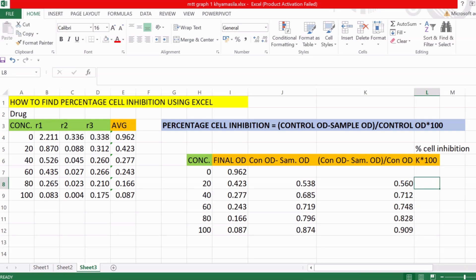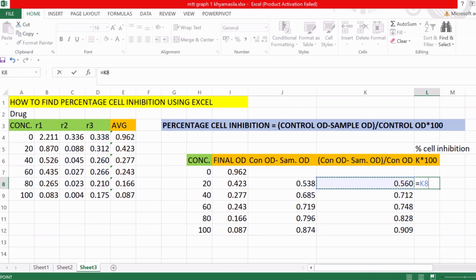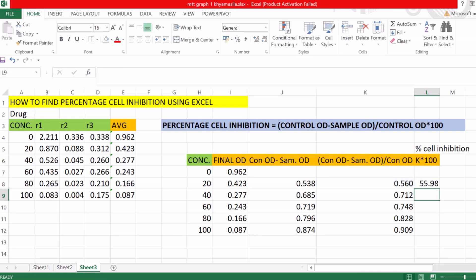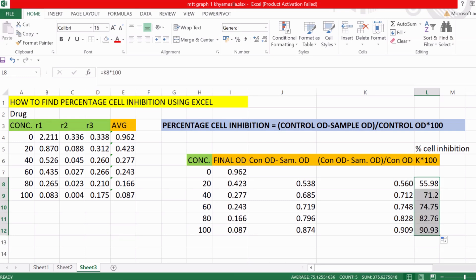The third column multiplies by 100 to find the percentage. Do not forget to put an equal-to sign before you start calculating. So: equal to, select the second-column cell, multiplied by 100, press Enter. Then drag it down to the last concentration — this is how you get the percentage cell inhibition. This last column is the final percentage.